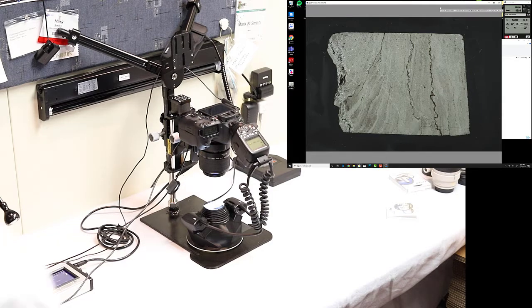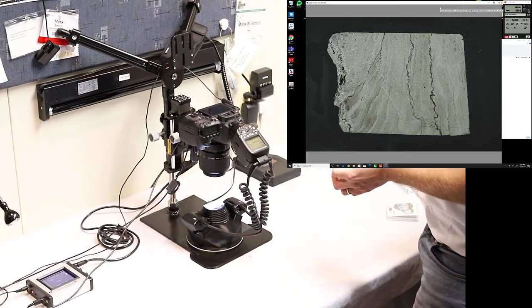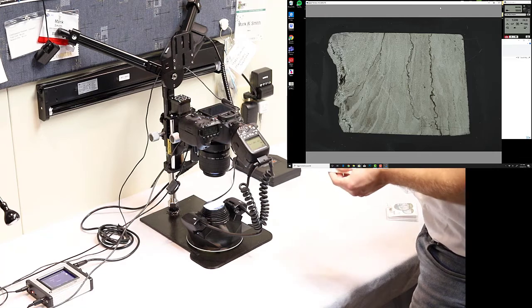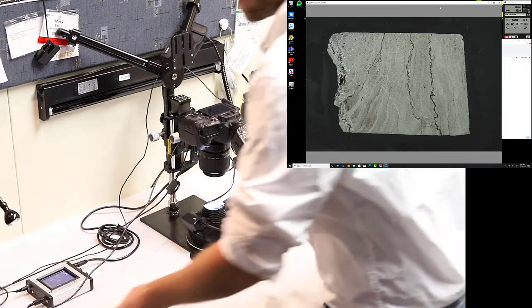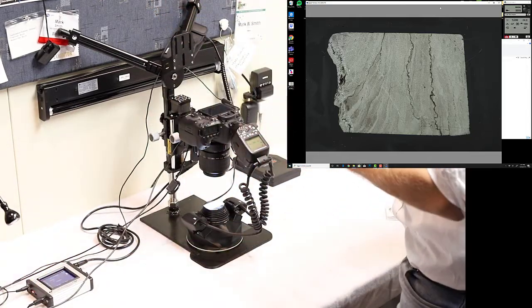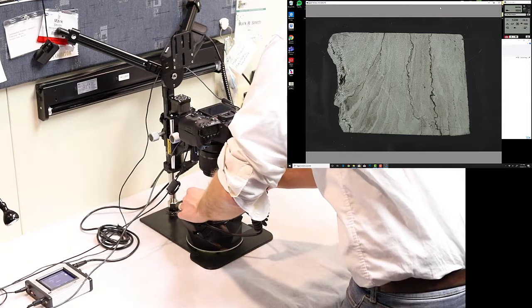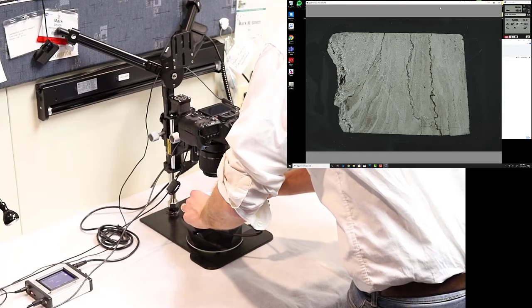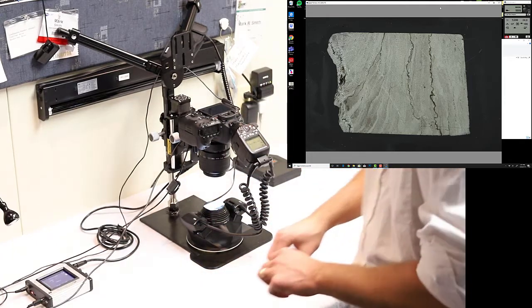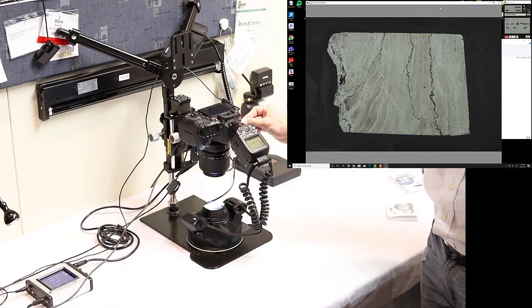Okay, so that's done. Instead of taking our polarizer back off, since we're going to take another image using cross polarization, we're going to leave that polarizer on the front of the lens, and we're just going to swap out slides. It's possible we have to reset the focus stack, but generally slides in thin sections have equal widths, so we're going to rely on that fact for a second while we try to focus stack through this image. But I will show you how to set it up just in case you need to do that again. So we're going to go right back into automatic mode.